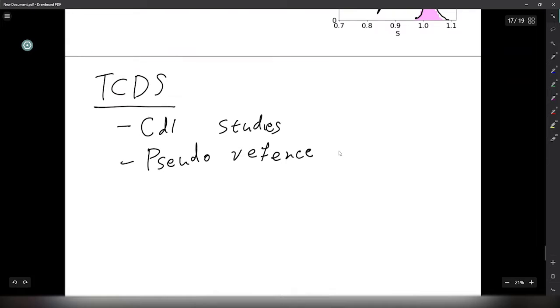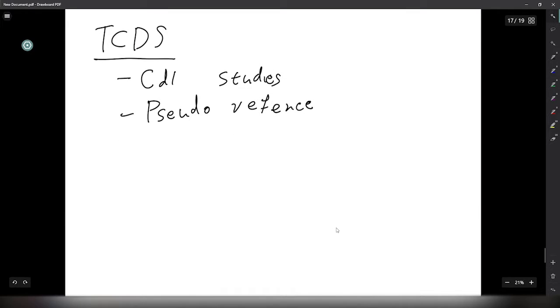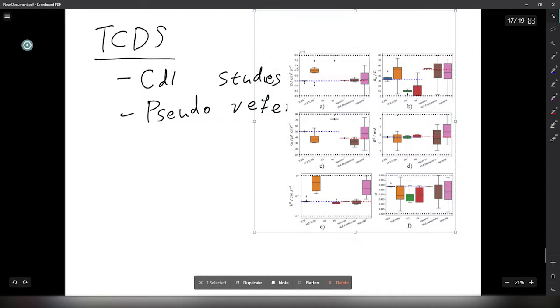We also have loss functions based on Fourier transform and frequency domain. I recommend not using those because they don't give very good data, as seen in another image I'll just get up now. Yeah, they won't give very good things.